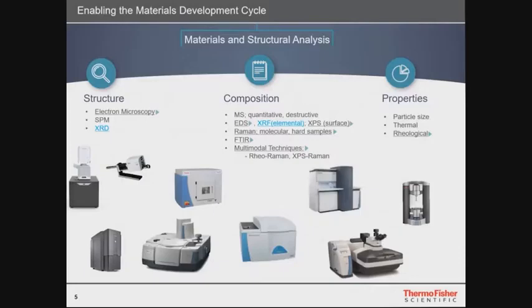We have an even bigger number of instruments which can help you determine the composition of materials, like mass spectroscopy, EDX. There is also XRF. We have XPS, Raman, FTIR, and some combined techniques. And we can also investigate the properties of materials like particle size, thermal properties, and rheological parameters.